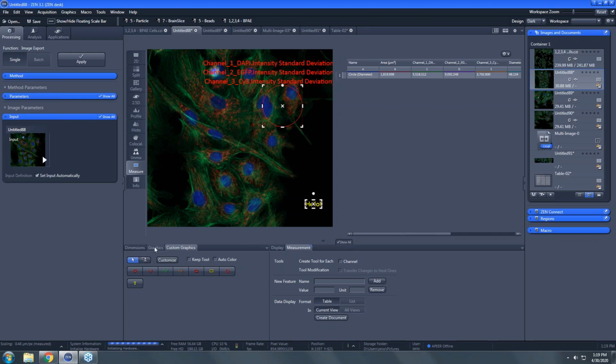Okay, what do you think? We covered the manual annotations and measurement. I think so, right? Yeah. We have a question here. I have to expand this question window. So there we go. Oh, okay. My apologies, folks. We have a number of questions. I thought I was watching, but it didn't notify me.